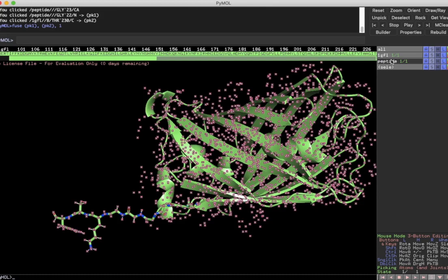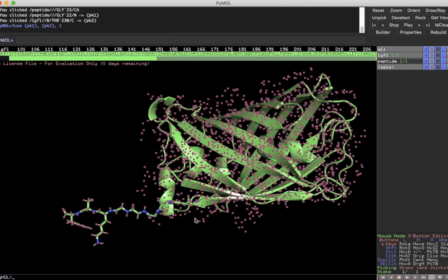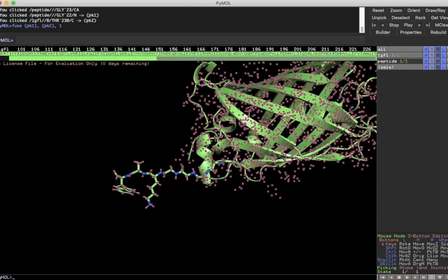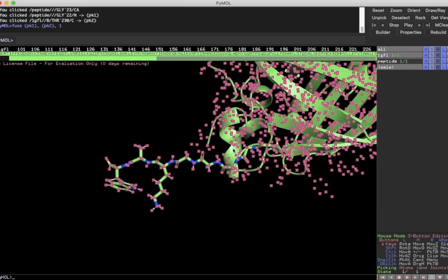And so these programs often have little glitches like this, and often one of the solutions is to export and import into different programs. So before we get there, let's go ahead and do some sculpting, and then we'll open this up in a different program, and hopefully we can fix this problem.